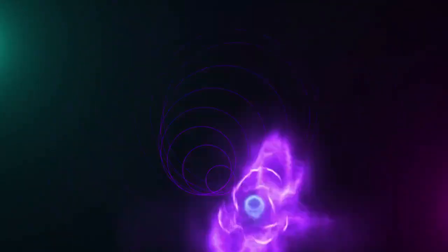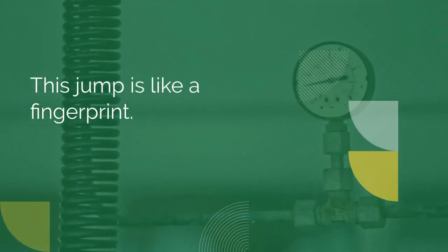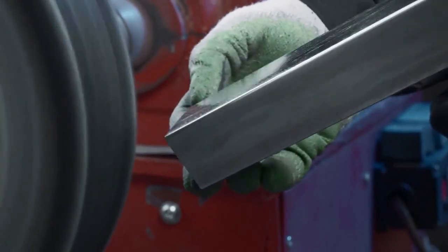But when the X-ray has the exact right amount of energy, it can knock an electron out of its deep, inner shell in an atom. At this specific energy, called the absorption edge, the atom suddenly starts absorbing a lot more X-rays. This creates a sharp jump on our data graph, and the exact energy where this jump happens is like a fingerprint. It tells us exactly which element we are looking at, whether it's iron, copper, or nickel.